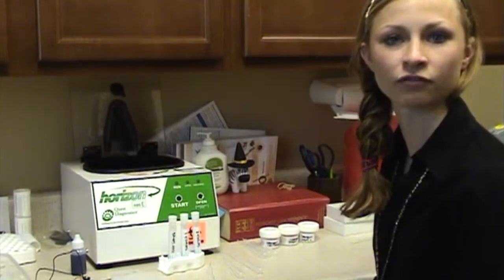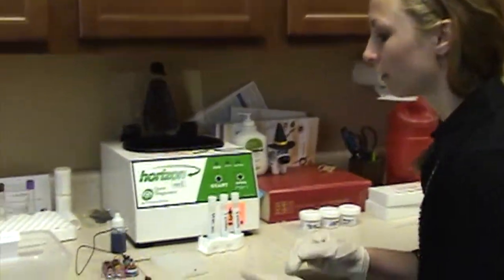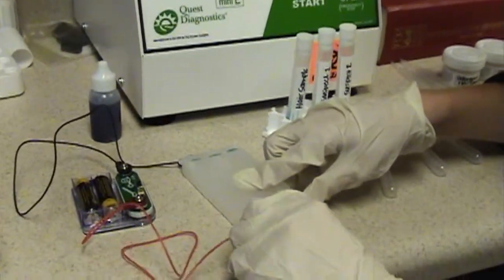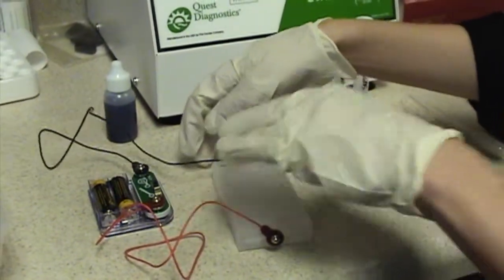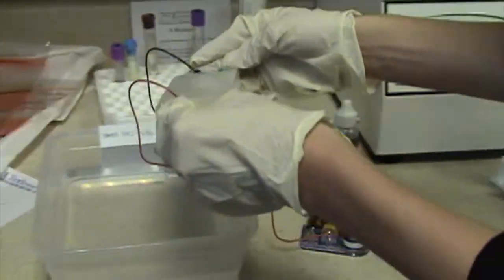I am now going to attach positive and negative charges to the agar gel and place it fully submerged in water in order for the DNA to move through the gel. The positive end will go at the bottom because DNA is negatively charged and will be attracted to the positive. The negative will be at the top in order for the DNA not to jump out of the agar gel. I am now placing it in water.